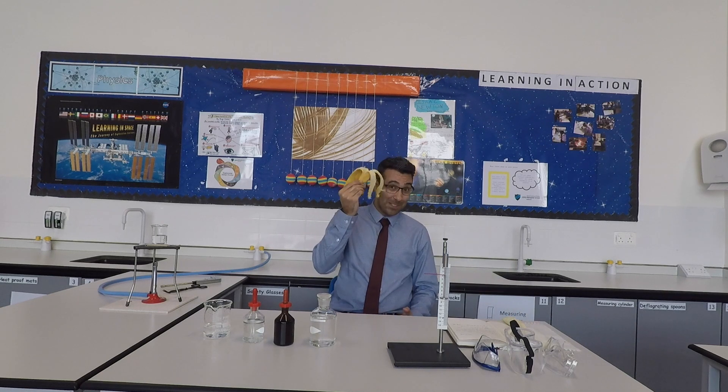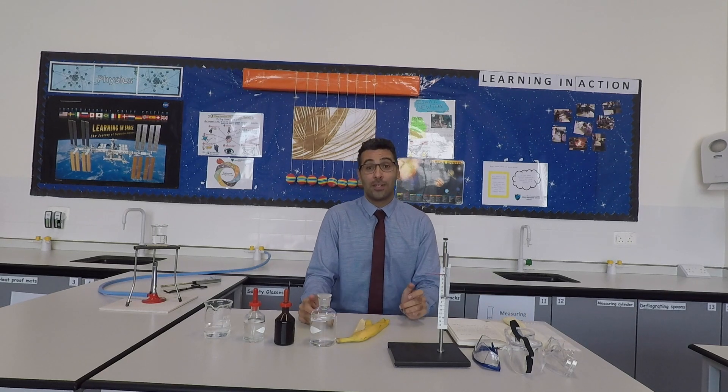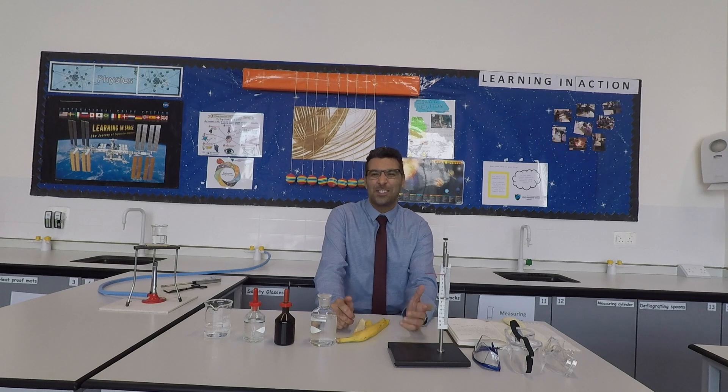Talking about safety — safety is number one... no. It's number two priority. Number one priority is fun. So make sure you have fun.